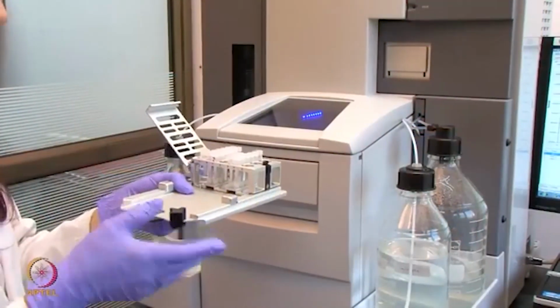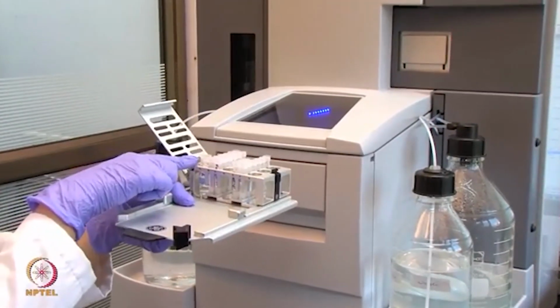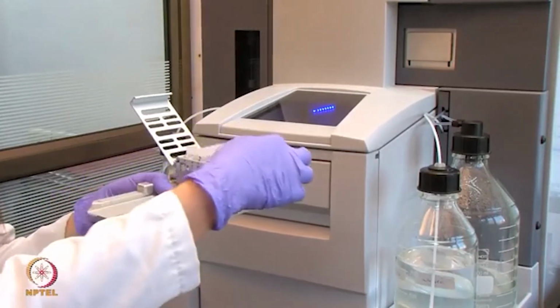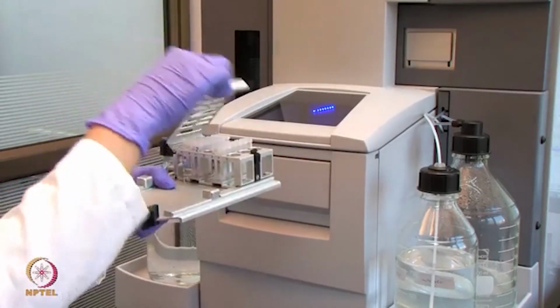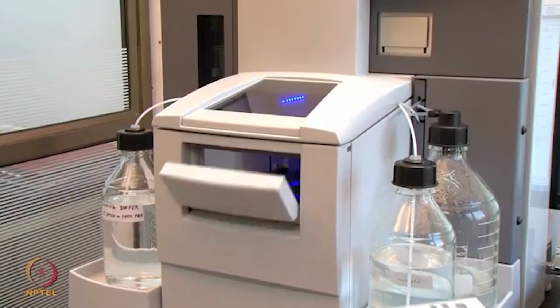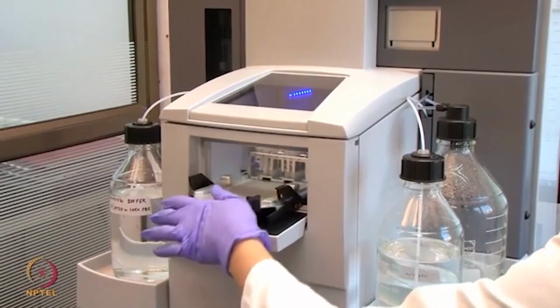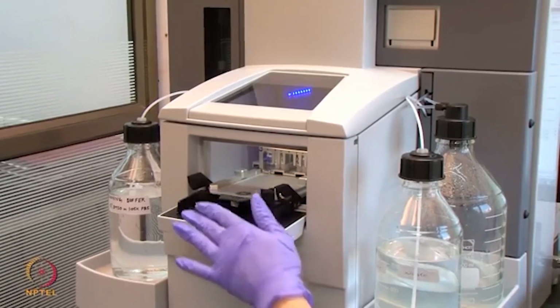We have now placed all the tubes inside the rack, including the wash solution, the furosemide samples, the startup and the solvent correction solutions. And now we will place this rack inside the system to start with our kinetic assay. We will now start with our run as demonstrated in our earlier lectures.